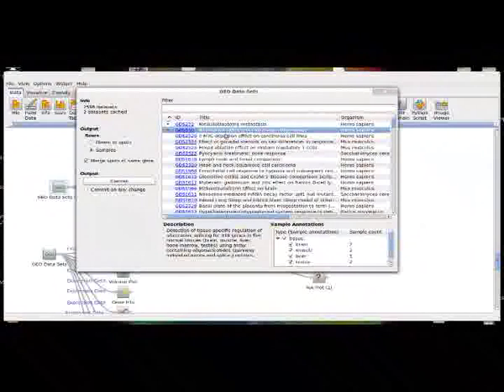So in this example, we're going to use this alternative splicing of 5 different tissues from human samples. It's looking at brain tissue, muscle tissue, liver tissue, testes tissue, and bone marrow tissue. And this is data comparing the mRNA expression levels of various genes of interest that help differentiate those tissue types.